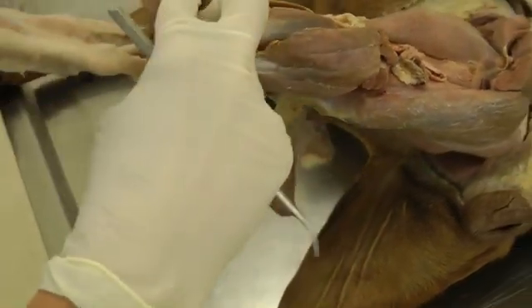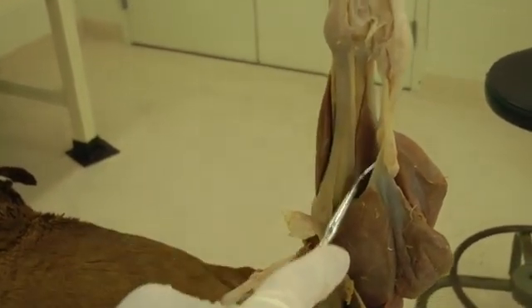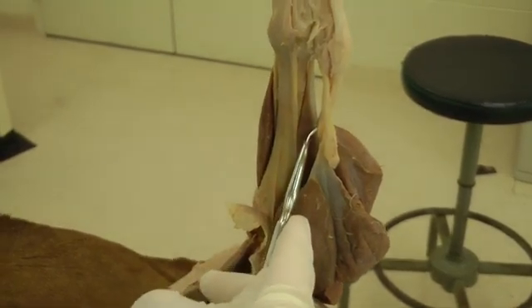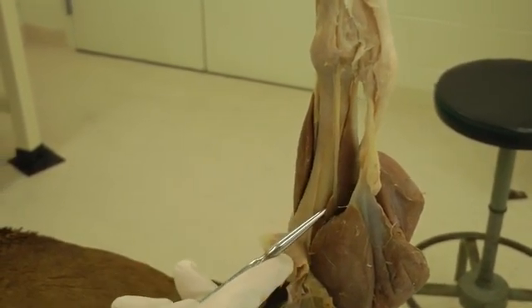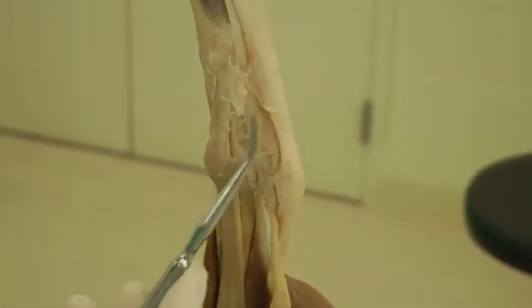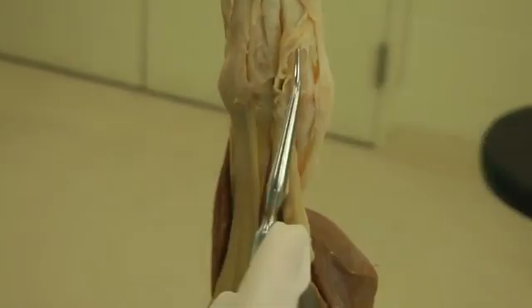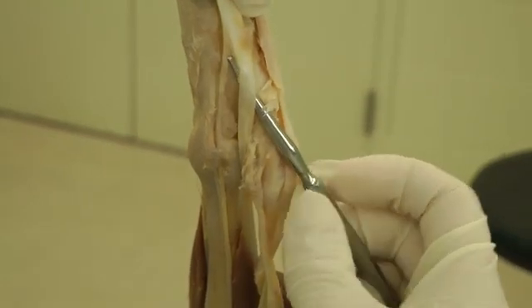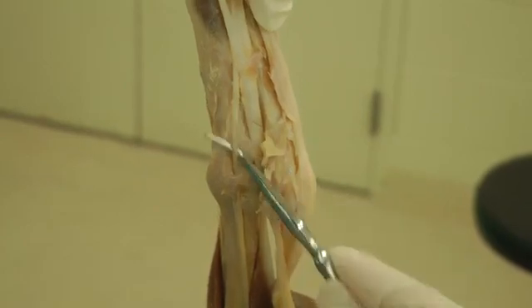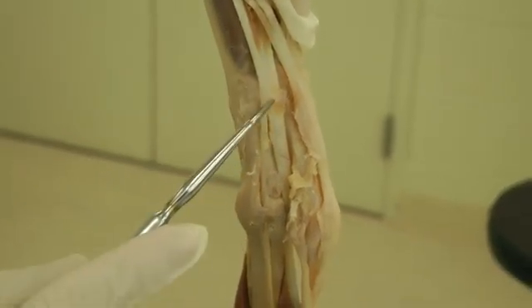I'll flip this over to see the tendons come down from this angle. Here again is the lateral digital flexor, and then you have the medial head coming down — this is the tendon of the medial head. You can transect your gastrocnemius if needed as well. Those two tendons join together. You have a flexor retinaculum here, just like in the forelimb, holding those tendons in place. You cut through that and pull the tendons out. The lateral head and medial head of the deep digital flexor come together just below the hock.